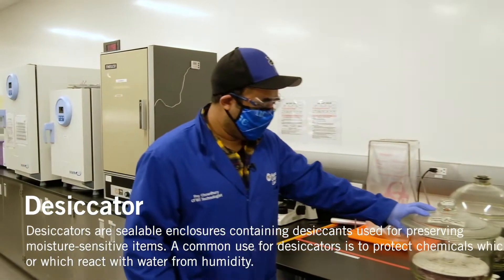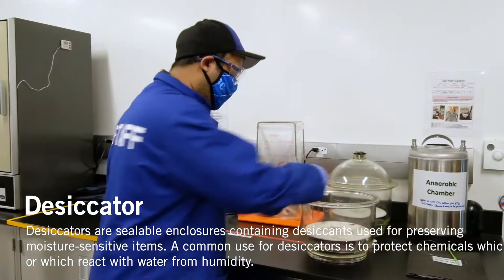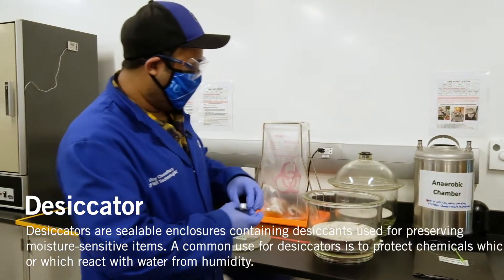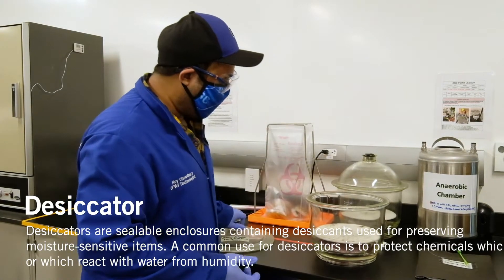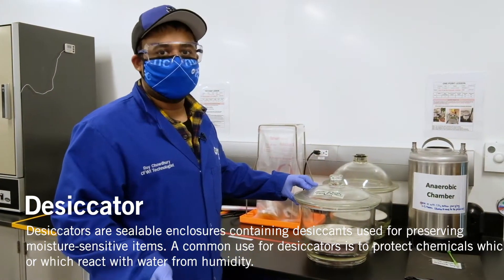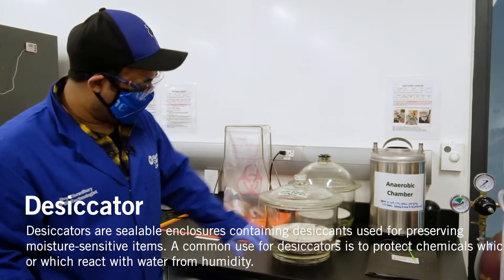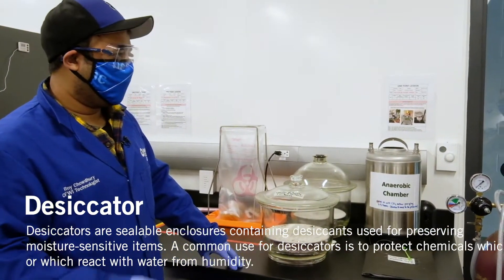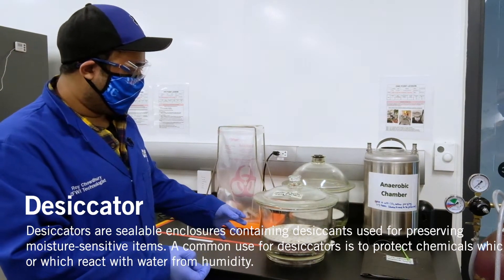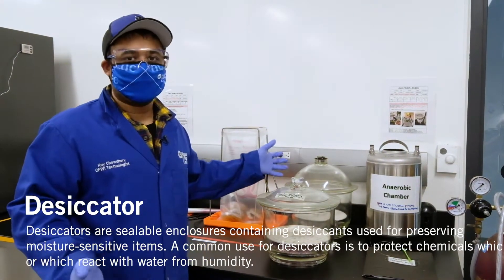There are also the desiccators as well. As you can see, there's a candle in here. Once you start the candle up and place it in here, it just burns off all the oxygen. I know it sounds similar to the anaerobic chamber, but this basically doesn't have any oxygen present in there. It's just an easier way rather than opening and sealing it — just another way of doing things.